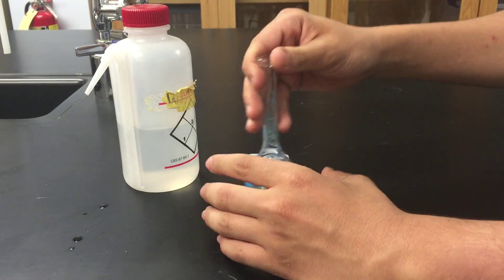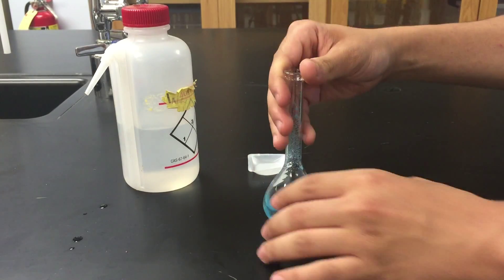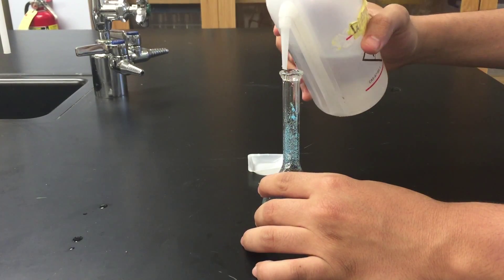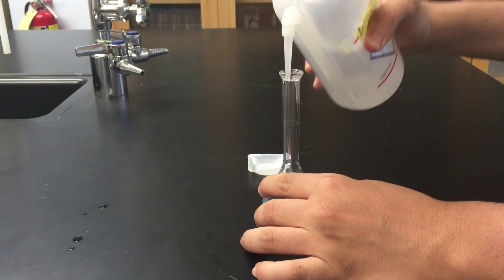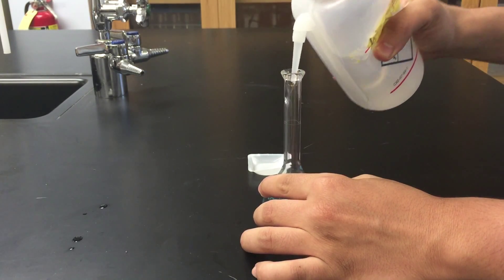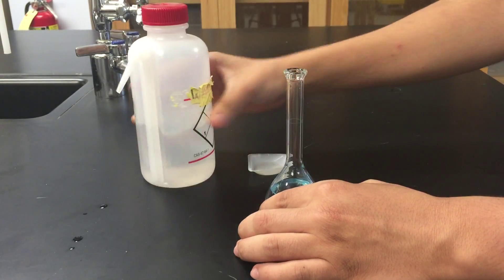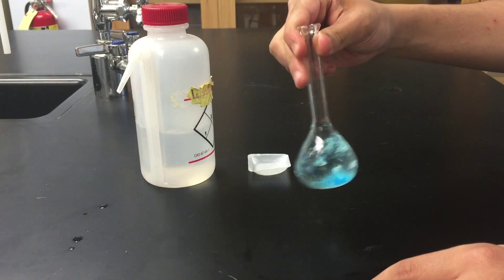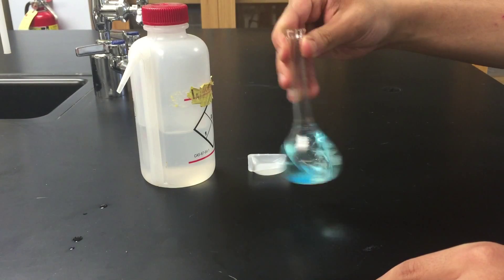Make sure to swirl the flask to dissolve all of the solid substance, and also rinse the sides of the flask with DI water. Swirl constantly until all of the solid is dissolved.